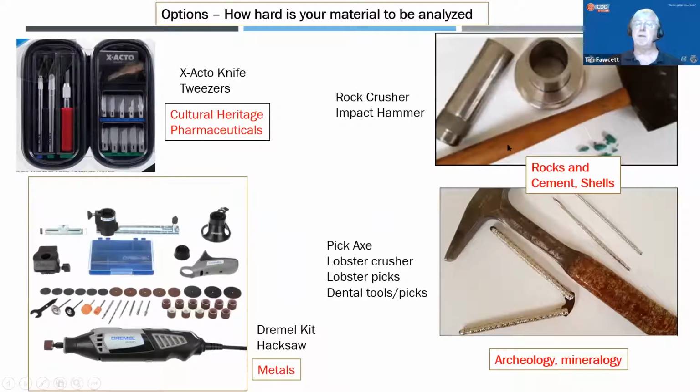Now, depending on the field that you're in, there may be other things that you want in your lab. Hard materials, your arm is going to wear out before you crush it down to the fine size. If anybody's tried to crush down sand or quartz, they'll realize the problem. You can get real tired real fast doing that with a mortar and pestle.